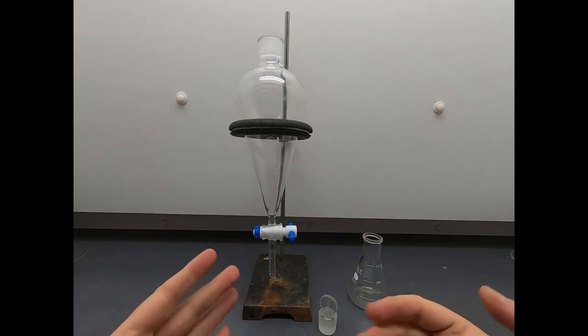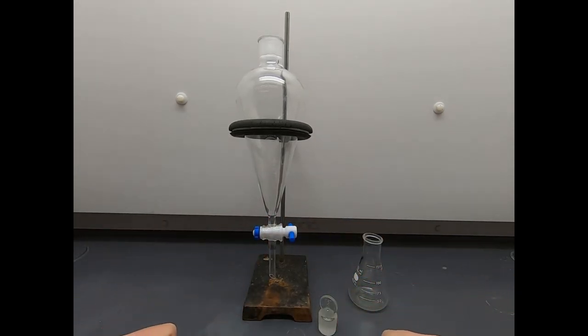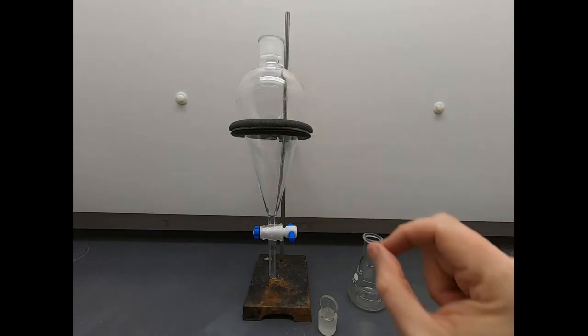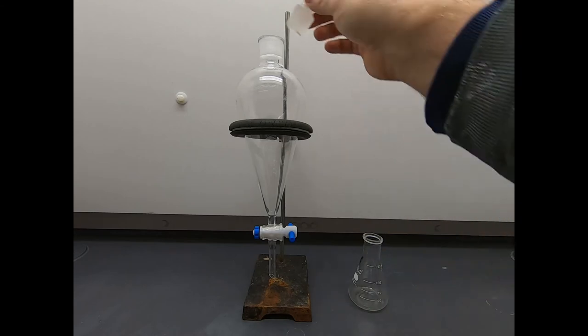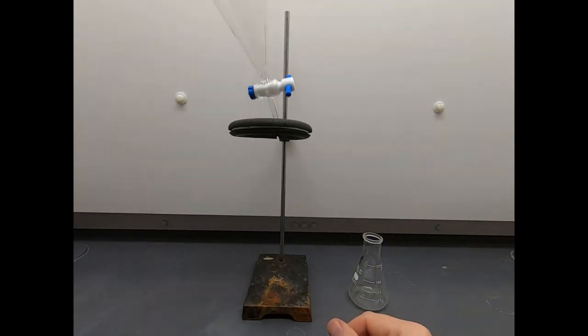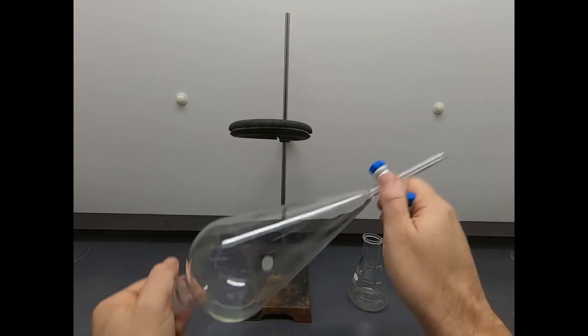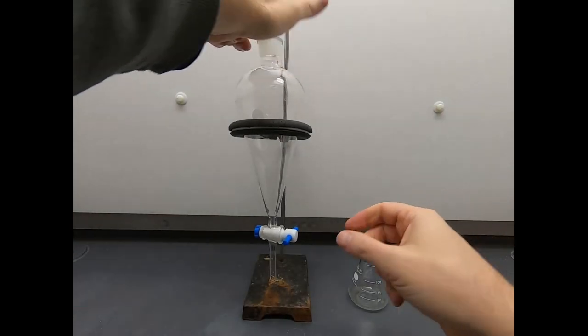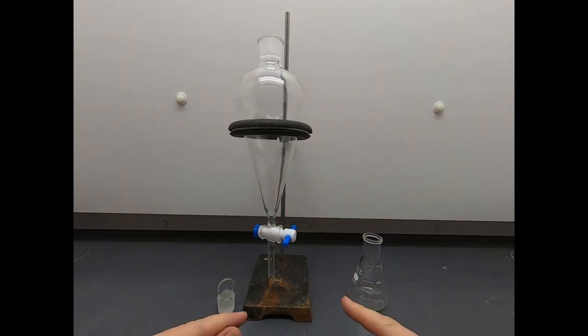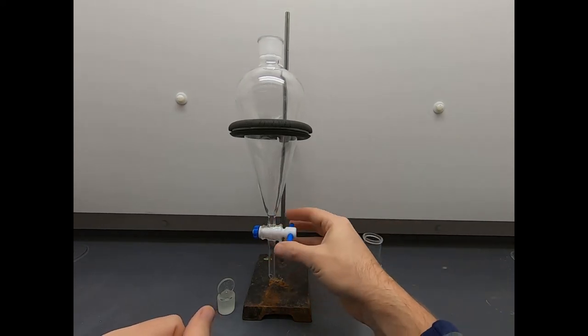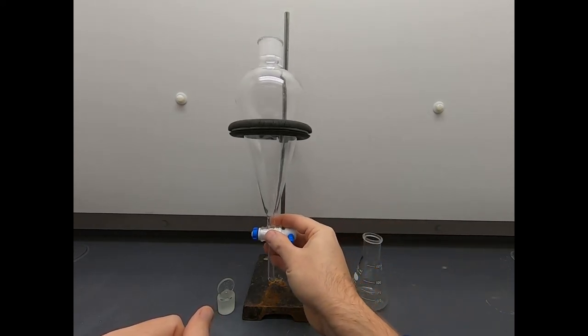This is a really common piece of glassware to encounter in a laboratory. It's great for what they call liquid-liquid extractions. We have two different liquids that we're separating from each other. It's a great way to get salts and polar materials out of our relatively non-polar organic material. We'll have a stopper in the top. We take these, we shake stuff up, let them mix, let the layers settle, and then we drain it out the bottom after we open the top. You see this all over the place, including Hollywood. This is called the separatory funnel.